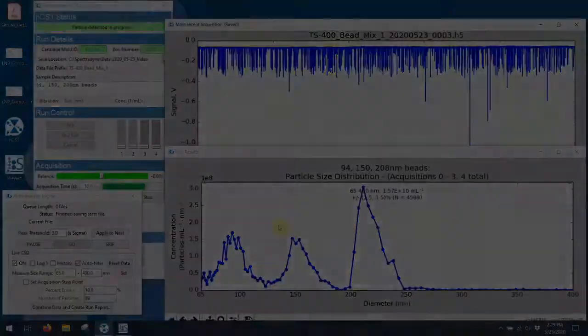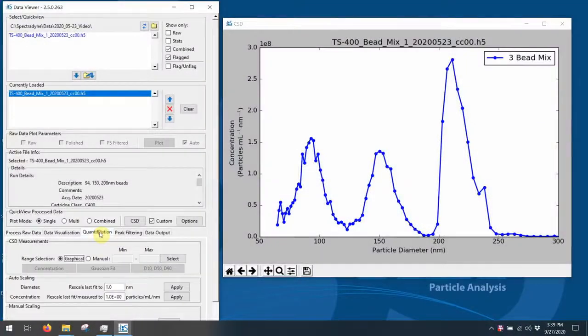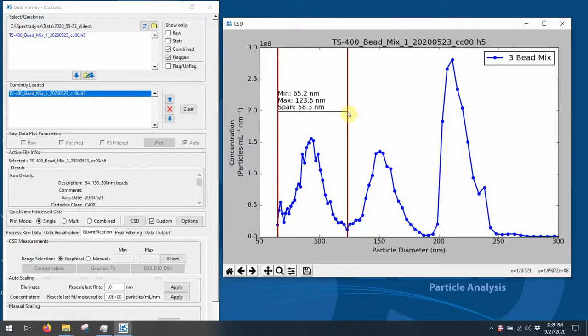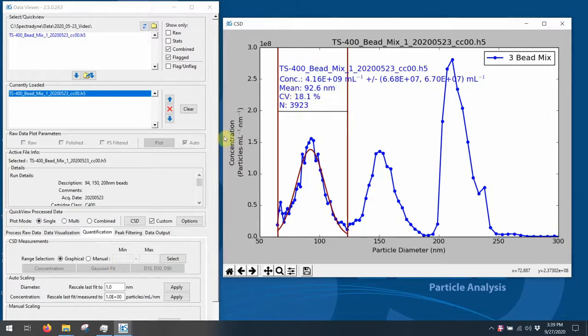Once the live data has been saved, we can bring it up in the viewer software to interrogate the data, make reports, etc. Here I've defined a region where the 94 nanometer particles are, and I can click on Gaussian and find out that the system measured them as being 92.6 nanometers with a concentration of 4 times 10 to the 9th particles per milliliter. I can do the same with the 150 nanometer beads, again just outlining it and fitting a Gaussian to it.